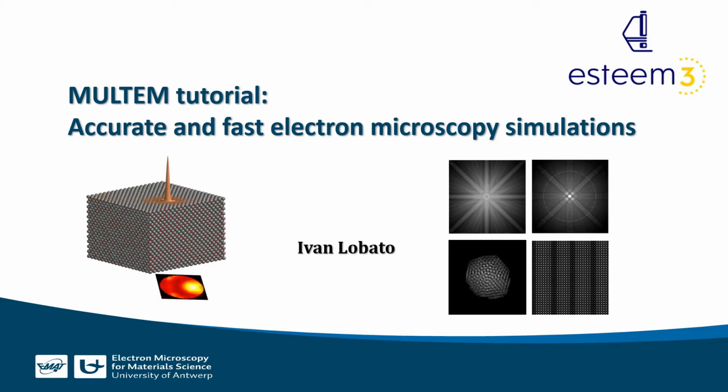As we go along with this tutorial, we will run some examples to experience the effects of different parameters on the simulation.